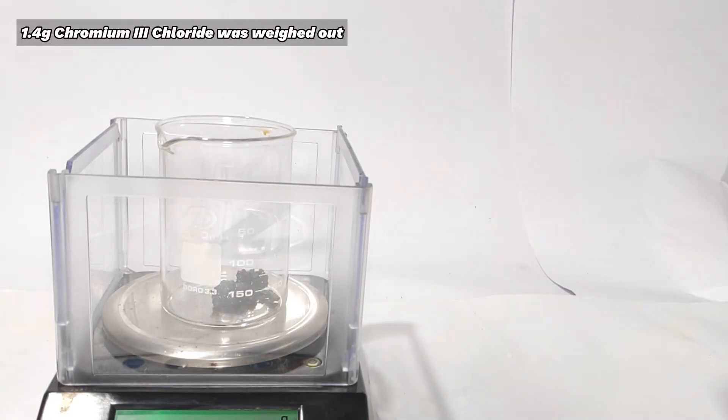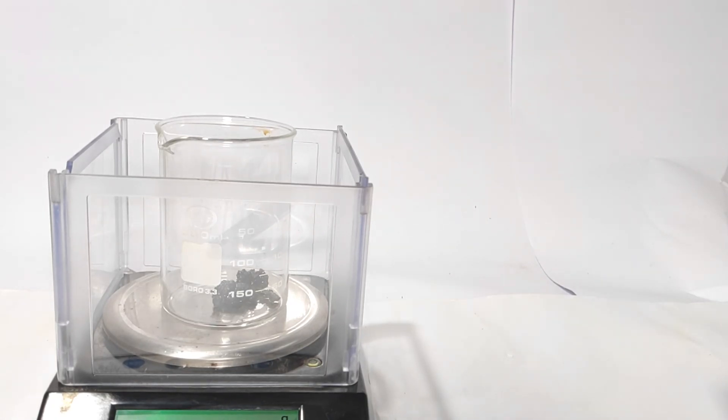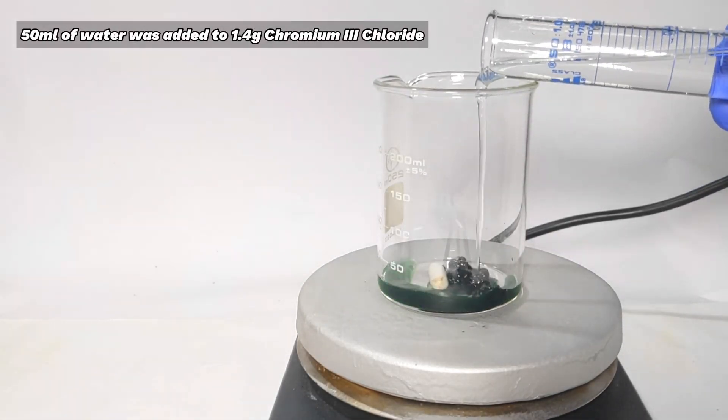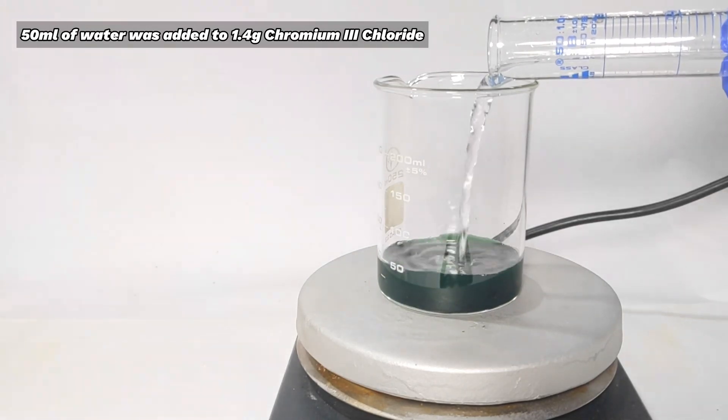Then 1.4 grams of chromium III chloride was weighed out. It is pretty hygroscopic - after a few minutes of keeping it open it has already absorbed water. A 250 milliliter beaker was placed on a hot plate stirrer with a stirring bar inside.